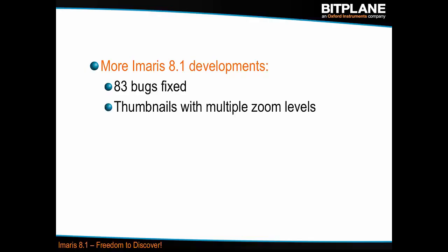We also introduced a nice feature to zoom, to make the thumbnails bigger and smaller in Arena. That's good for bigger and smaller screens. And one thing I really like, and it's a very simple thing, but very nice, is the import of a full experiment with all the folder structure that you have already created. So with 8.0, you would have to recreate the folder structure by hand.